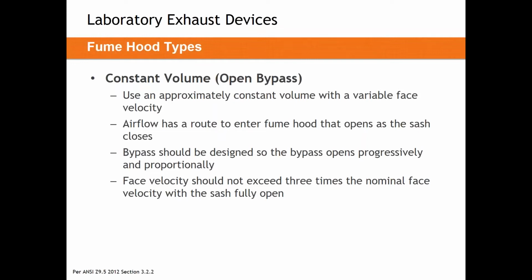We're going to start by putting constant volume and variable volume fume hoods side by side. Constant volume fume hoods were previously a little bit more popular when energy was a little bit cheaper and we didn't have to worry about lowering our air change rates in laboratories. However, constant volume fume hoods are still quite popular. They're still in heavy usage today, but they do have a certain application we're going to touch on.